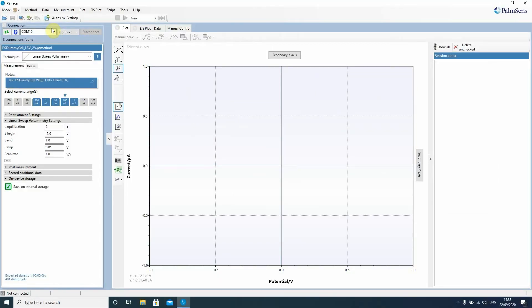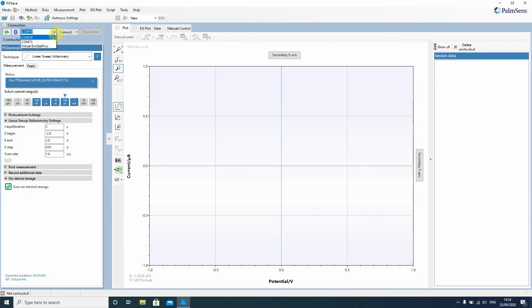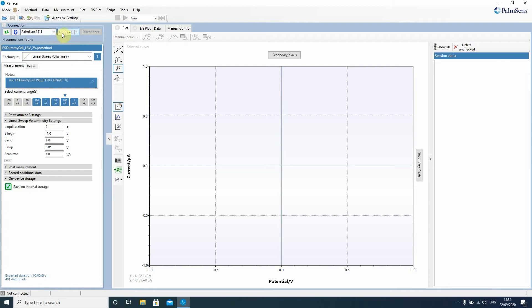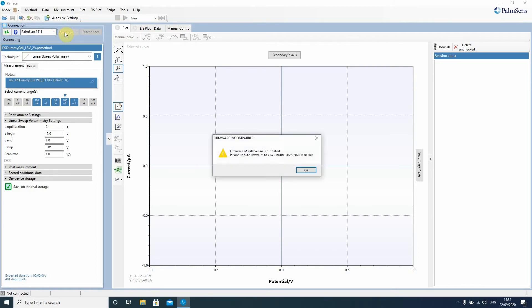You look for the connection section which is up here in the left and in the drop-down menu you want to find the Palm Sense 4. It's not in there yet so we press the refresh button and it appears. So when you press the refresh button it looks which USB devices are connected. Then you press physically connected.